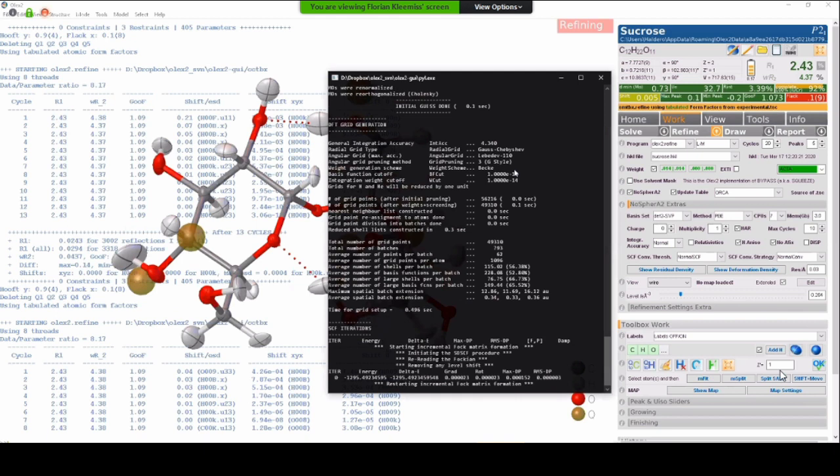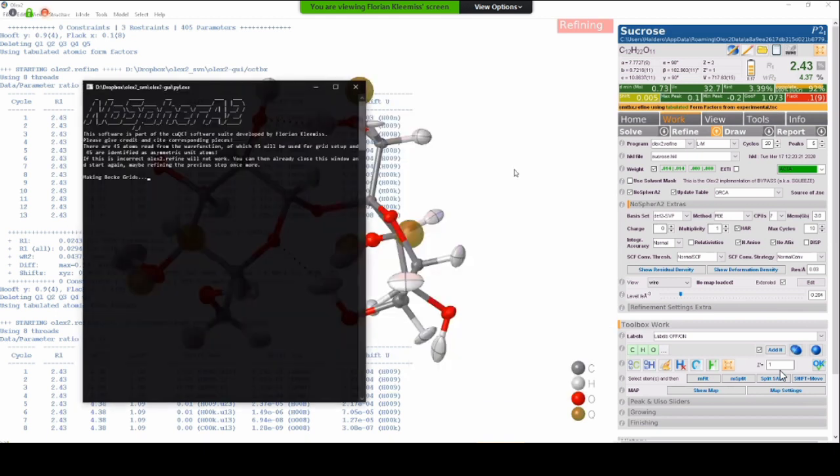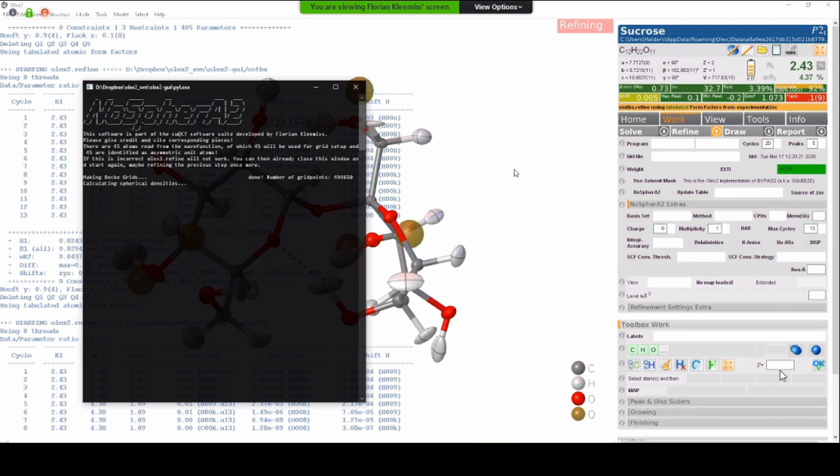There was a previous implementation of Hirschfeld atom refinement in Tonto, where the least squares was also handled by Tonto. But this implementation had some drawbacks. For example, the refinement of special positions in very high symmetric cases, for example, some cubic Fm-3m space group or something where you have many special positions.